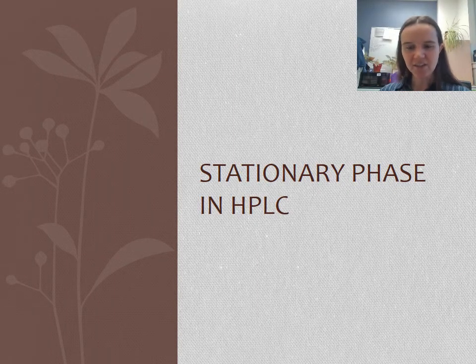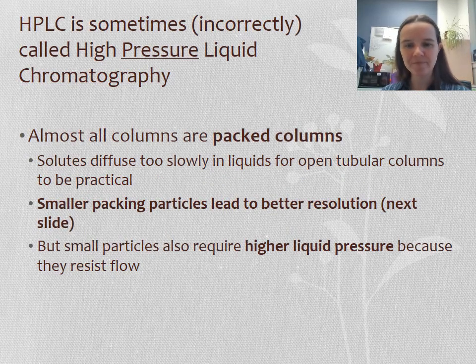The stationary phase in HPLC. First of all, HPLC is high performance liquid chromatography. Sometimes people accidentally, incorrectly call it high pressure, although you do have high pressures. Almost all HPLC columns are packed. The solutes diffuse too slowly in liquids to really use an open tubular column practically.